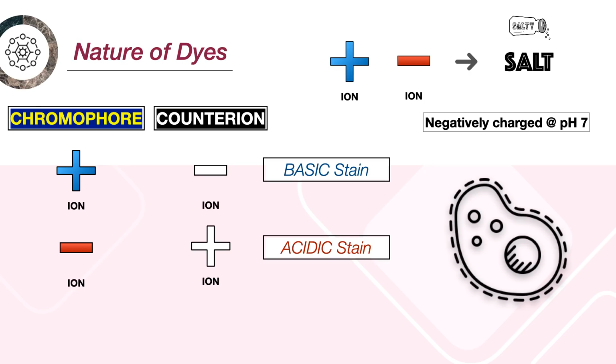Okay, yan yung kanyang charge because of the fact that the cell wall is made up of proteins like peptidoglycan, your teichoic acid. Basically, these are components of the cell wall that would render, okay, the bacteria, yung kanyang outer covering, as negatively charged. Now, based sa stains and the ions that they contain, okay, the colored ions that they contain, what do you think will stain the bacteria now kung negatively charged siya?